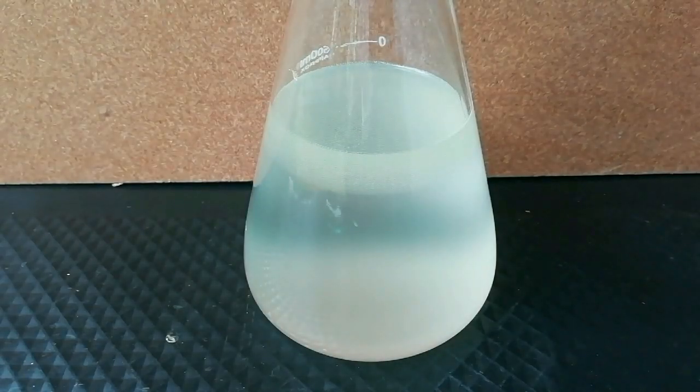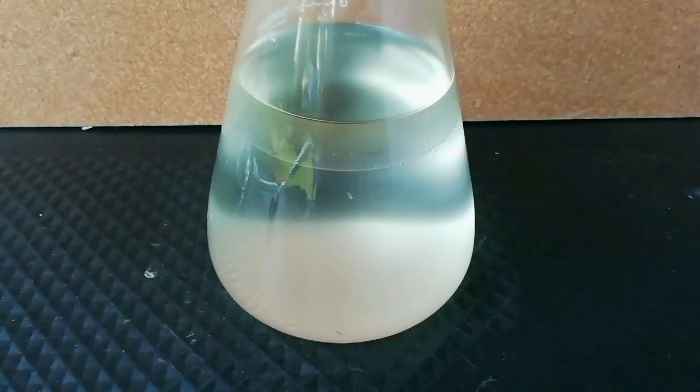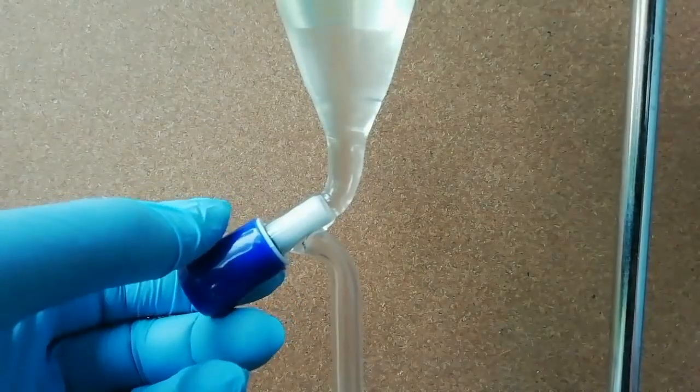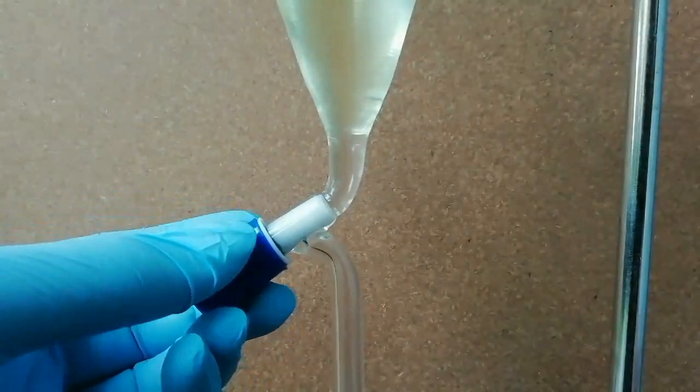Let it sit for two hours to separate into two layers. It is necessary that the solution is clear before taking it to the next step. Then separate the layers.